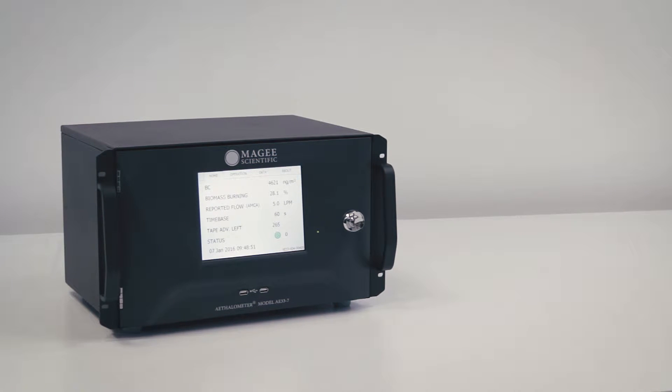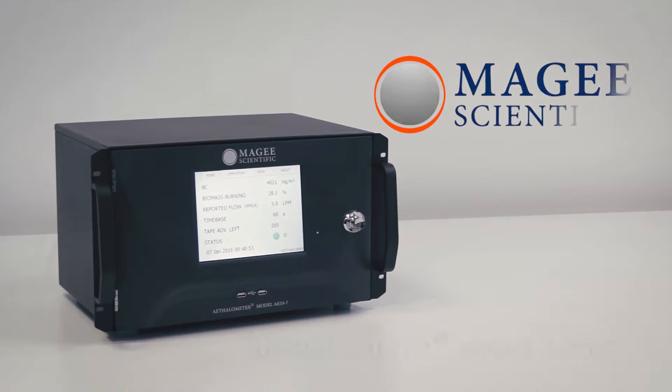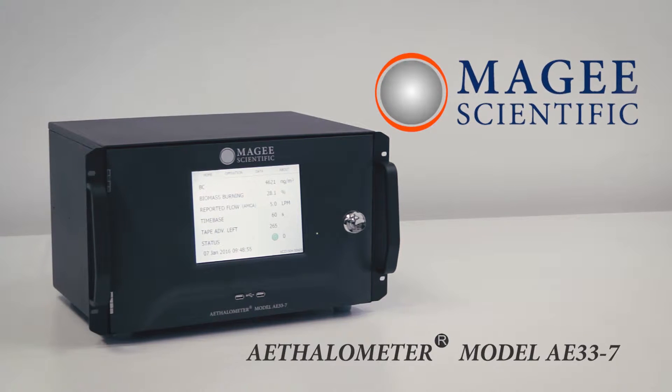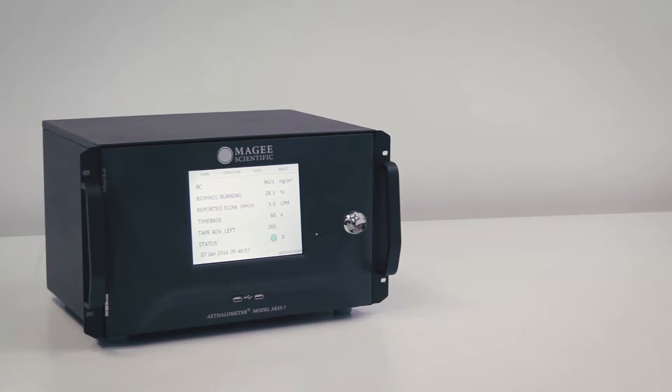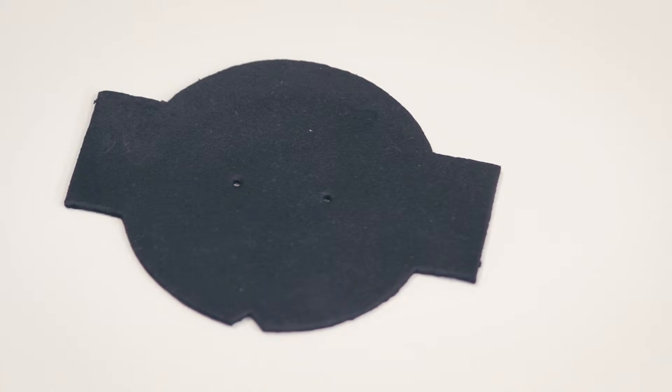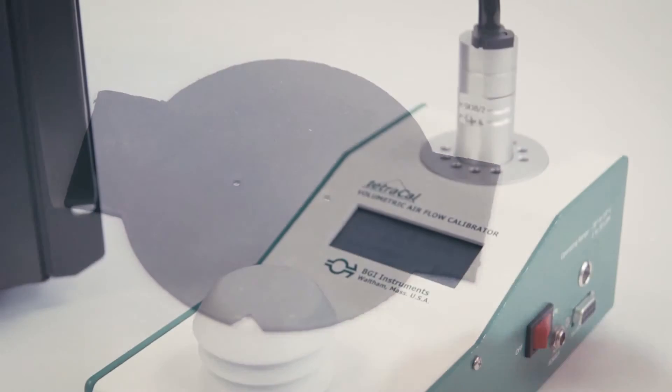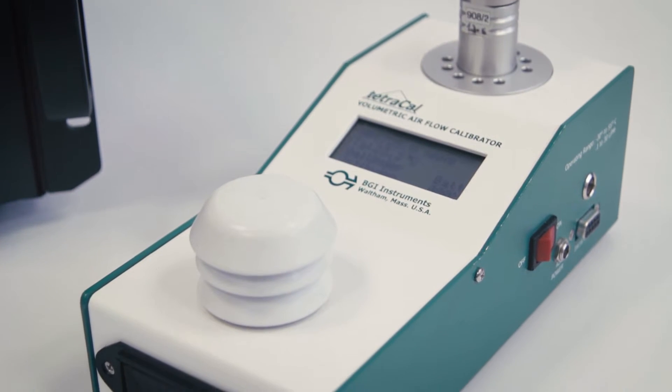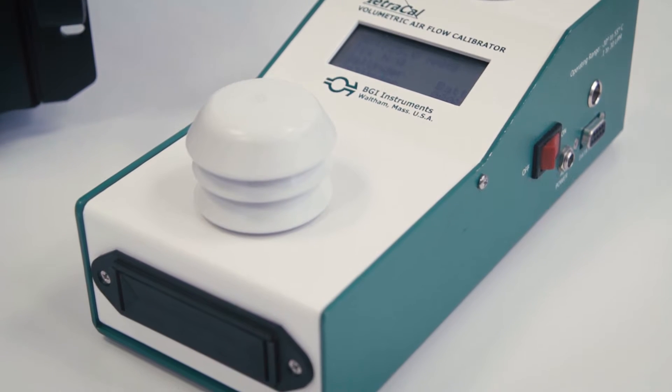This video shows the operations of the leakage test for the model AE-33 Aethalometer. For this test, you will need the flow calibration rubber pad, which is a standard accessory of the AE-33, and an air mass flow meter, which you can connect externally to the sample inlet port.